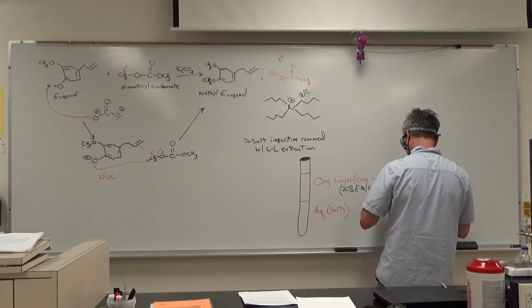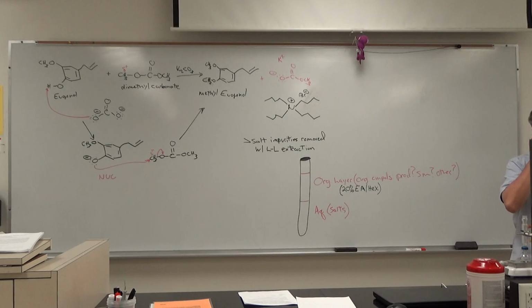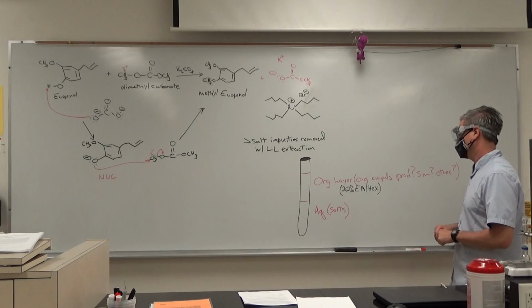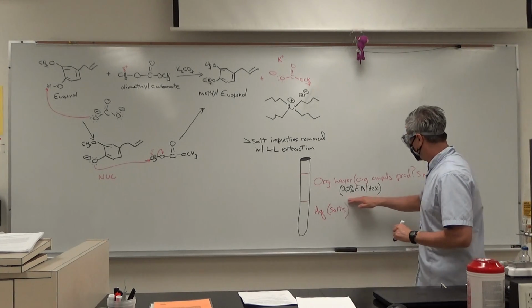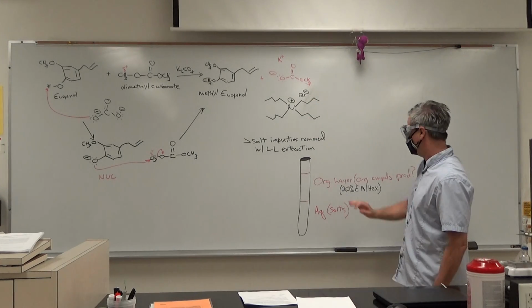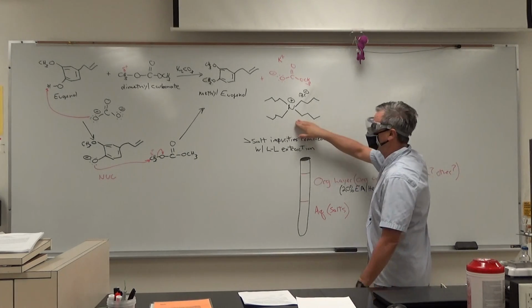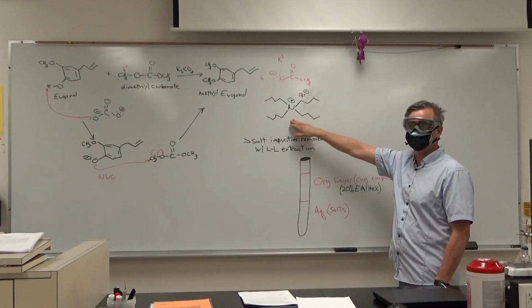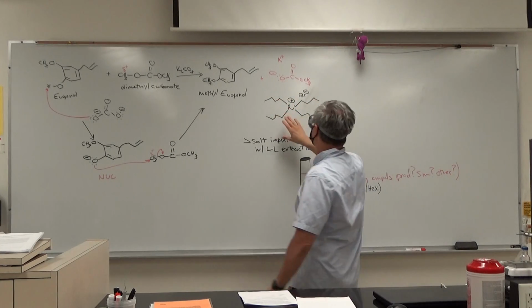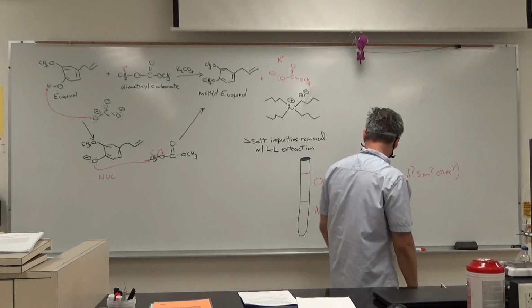It's a little bit of a strange choice. A lot of the time we do these with just a straight out of the bottle, 100% ethyl acetate, or whatever. 100% ether is a very common one. This one was discovered so that we could get rid of the ammonium bromide. The ammonium bromide wouldn't go into the organic layer. It's pretty organic soluble, so a lot of organic solvents that we might have used would have had this come along, and then it would have totally fouled up our product mixture. We want to get rid of all this stuff.